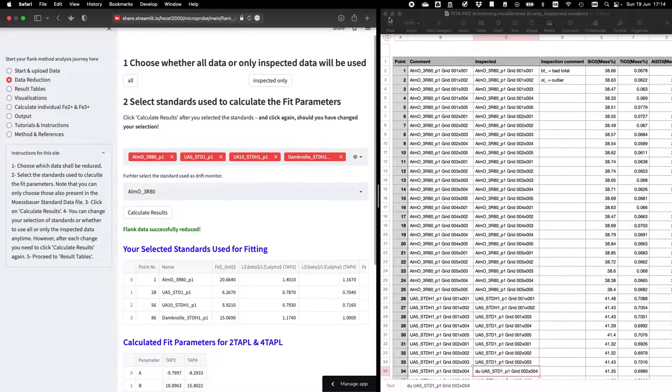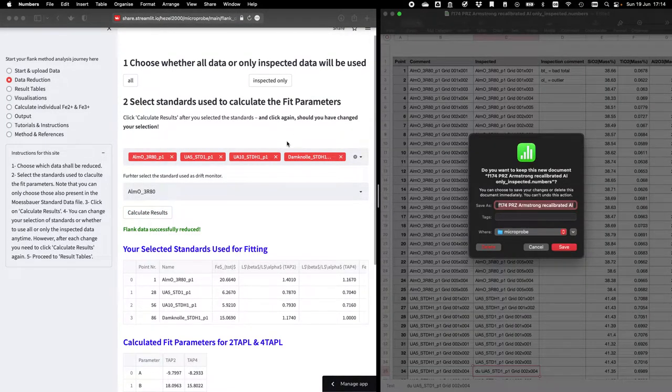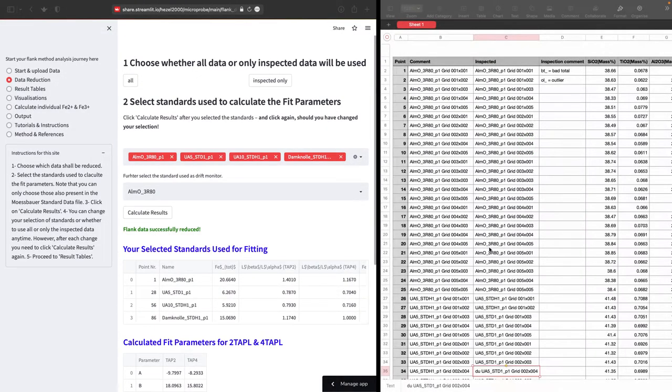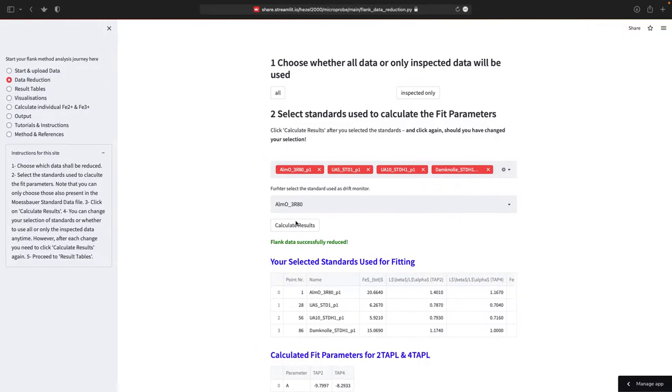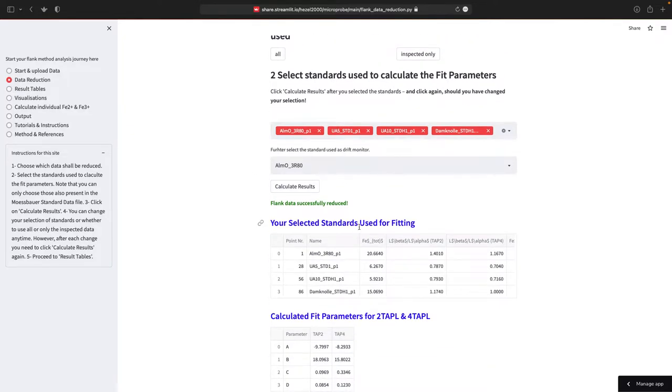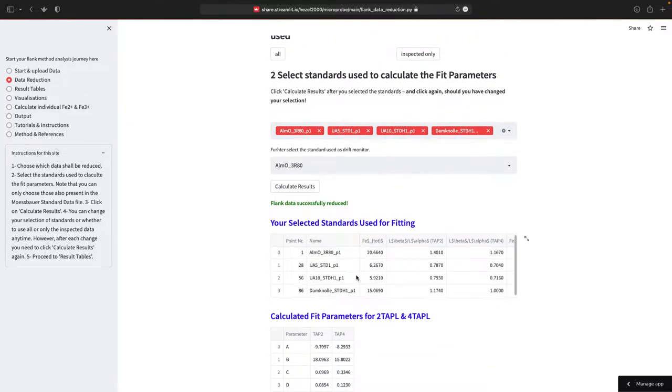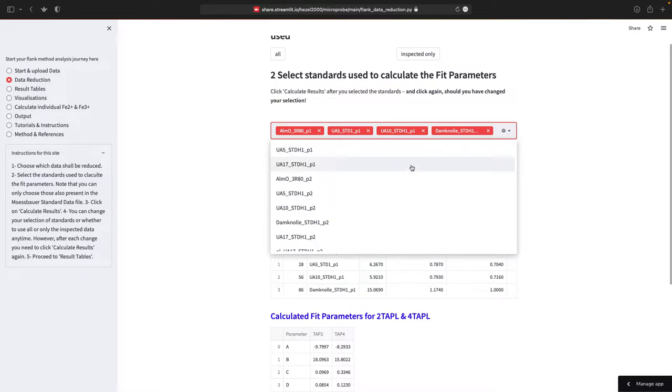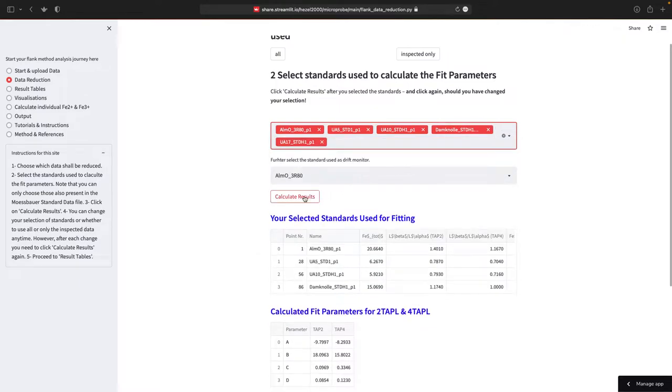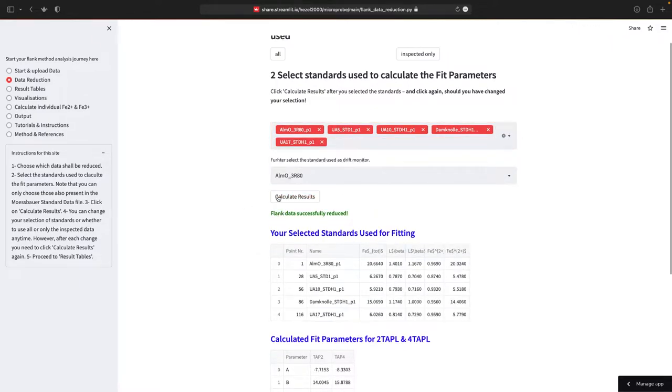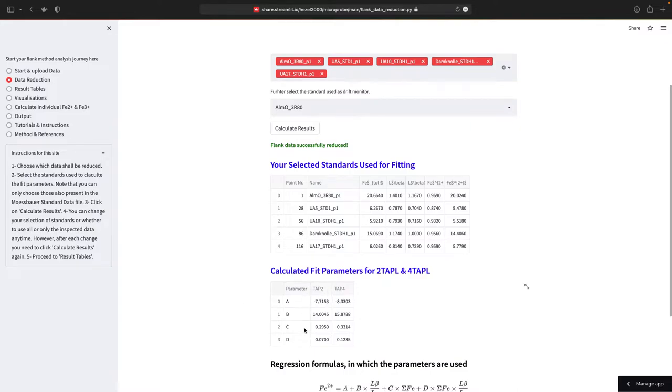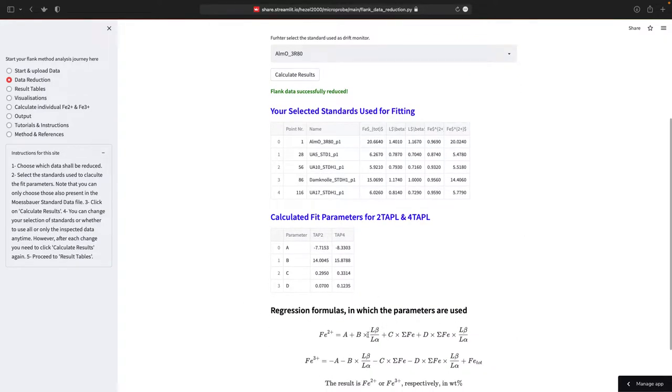I will close this so there's a little bit more space. So this is the result now. Here are the standards that you used for fitting. These are basically the standards up here. And you can change these easily by adding one, for example, and calculate the results again. So you need to click these, says it successfully reduced. And now you have five in this list here. This is just for information.